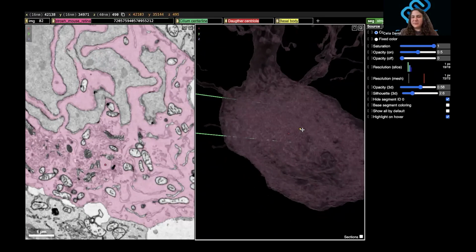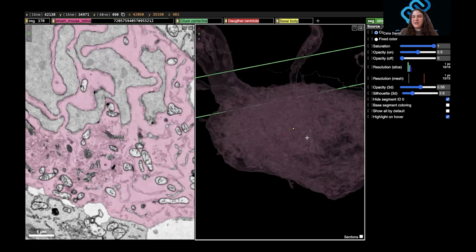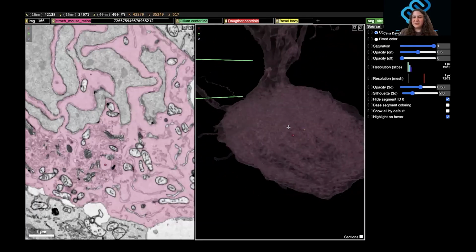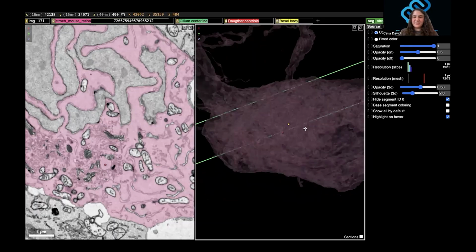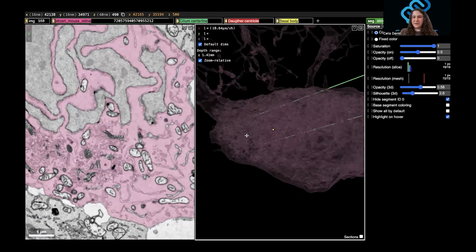Sometimes you might not be able to really know which one's the basal body and which one's the daughter. So I made my best guess on this one. I chose the basal body as the one that's closer to the surface. I think that's generally a good bet since they're attempting to go towards the surface. And then you'll just make a note that this is an internal centriole pair and there's no cilium exiting the cell body.